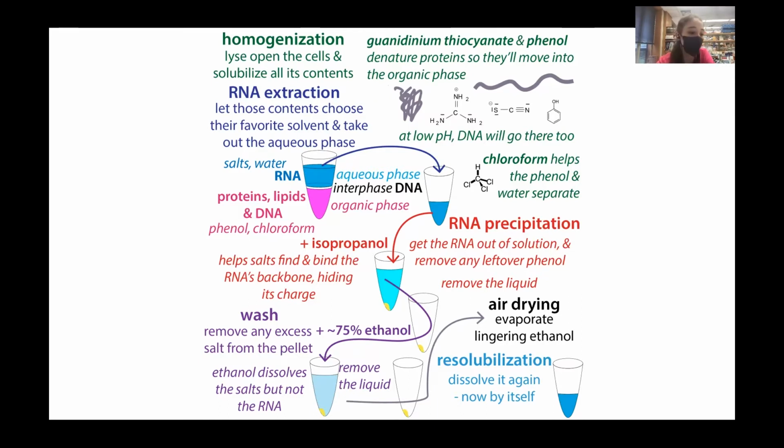And so typically, when we're working with RNA, we'll use RNaseZap, and wipe down our pipettes and everything with ethanol, and be really careful not to introduce contamination, because the RNases can kill things. And also, if you want to do qPCR or some other thing where you're going to want to see what RNA is in there, you don't want to accidentally introduce foreign RNA. And so it goes both ways depending on what you're looking to do.